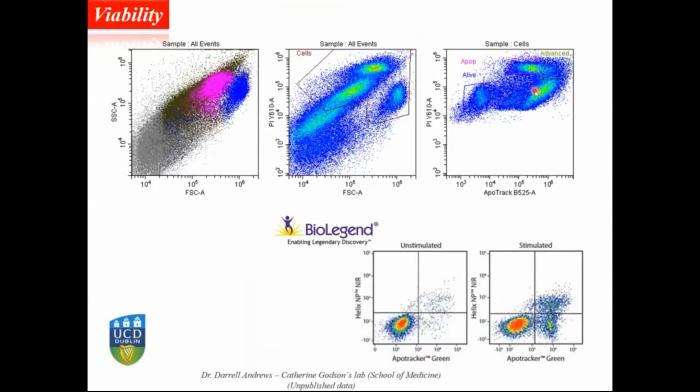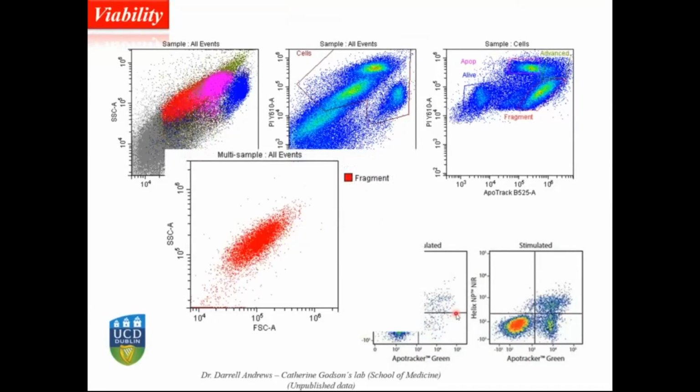Of course, this is my interpretation. Because it goes against this one, we need to verify it. So what we have done is looking at those different groups and sort them on the SRT. So here we can see how my fragments after sorting look like. And you see it's exactly in the same place as the analysis.